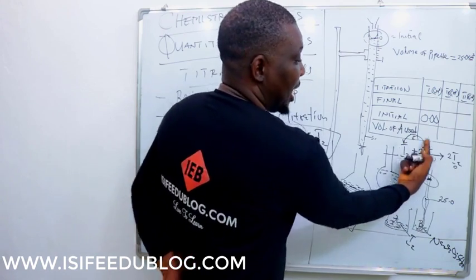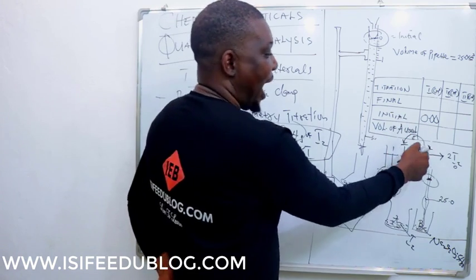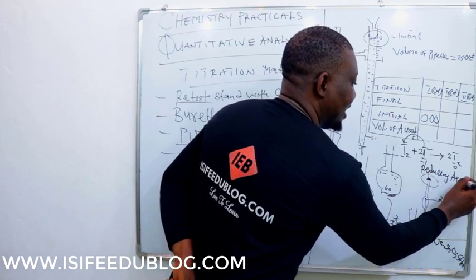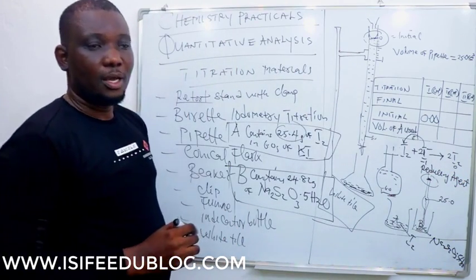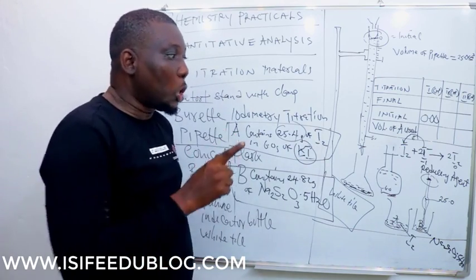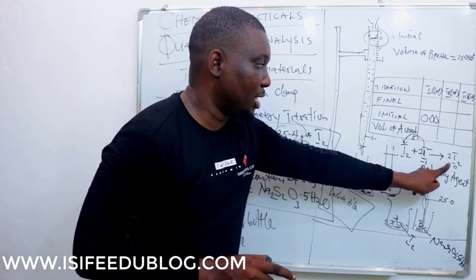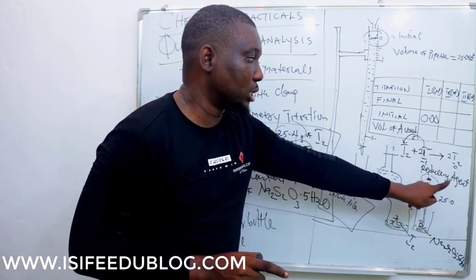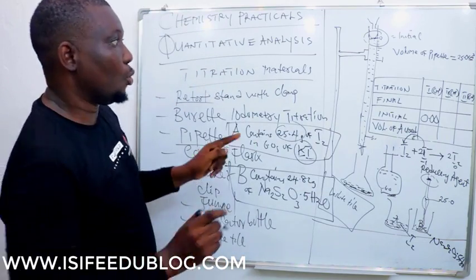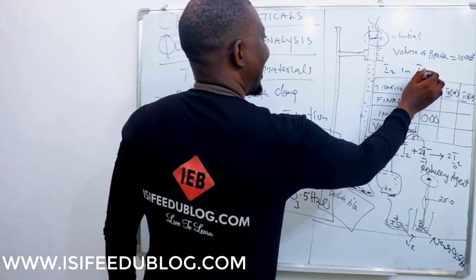This one is free iodine, having lost electrons to I2. When a substance loses an electron, I minus in this reaction is just acting as a reducing agent. So potassium iodide in this reaction is acting as a reducing agent, having lost electrons to iodine in this mixture. It will now oxidize to free iodine. So what you have here is a mixture of I2 in I minus.